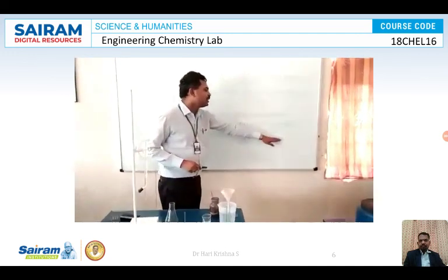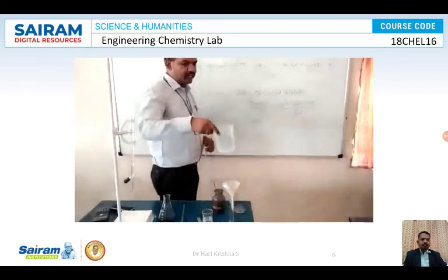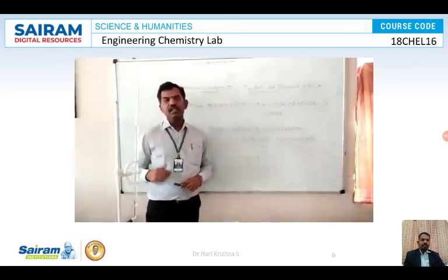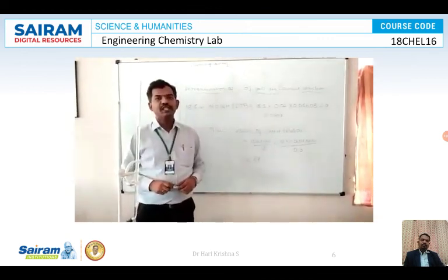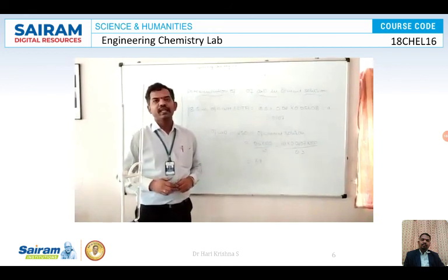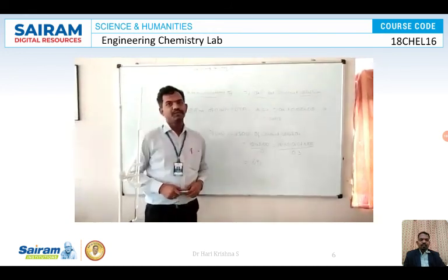On substitution, we get 69%. The cement solution whatever we have taken contains this much calcium oxide. Similarly, we can determine the percentage of calcium oxide present in various cement samples by volumetric estimation using Na2EDTA. Thank you.